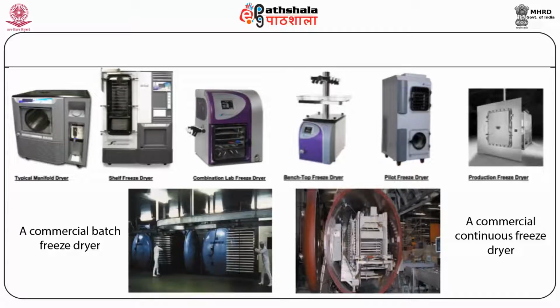It is very important to choose a particular type of freeze dryer, which will again depend on various factors. Choosing a freeze dryer depends on the product characteristics as well as many other application based variables, including the container that the product will be dried in, the shelf area or number of ports required to accommodate the quantity to be dried in each batch, the total volumes of ice to be condensed, and whether there are any organic solvents. The types and shape of product being dried and its end use also need to be considered.